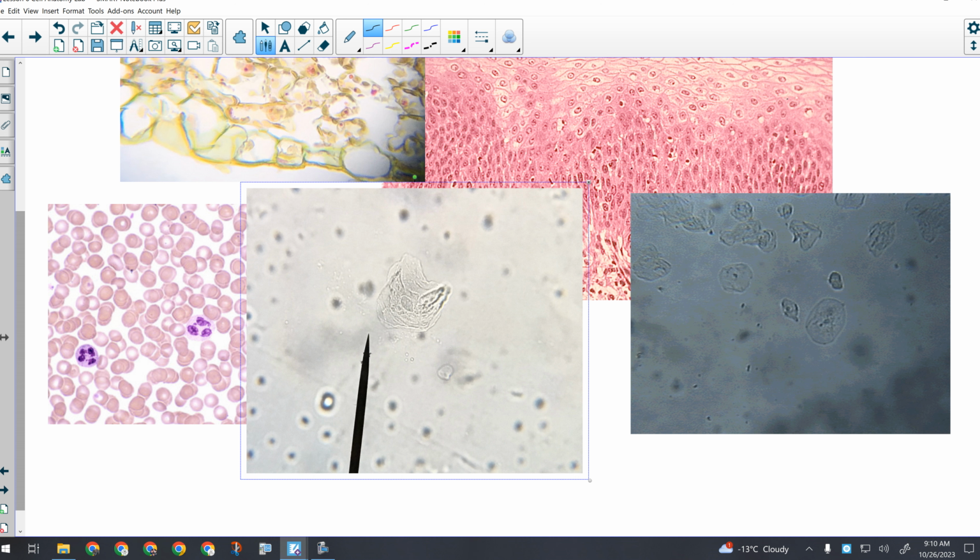You'll also see, regardless of how well you brushed your teeth or washed your mouth out this morning, there's still going to be food debris if you had breakfast, especially if you had something fibrous, like whole grain toast. Those fibers catch and stay in your mouth. If you see something big and dark, it's not a cell. The cells are actually quite transparent because we're not staining this. All of the other ones have had a stain added, so color has been added. These will not have that, so they're a little bit tougher to see.